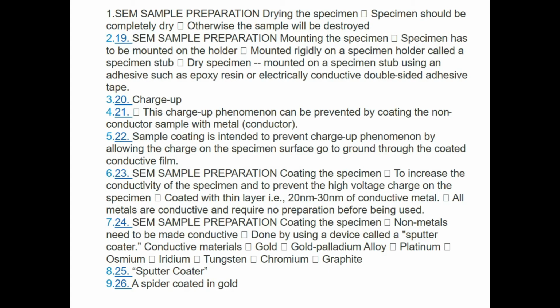So point is nothing but you can particularly pick one point and check the composition, and line analysis means from one end to another end you can make one line. Through the line you can check what things you have. Okay, what alloys or things you have in the line. And you can check for area analysis. Area analysis is nothing but you can focus on an area.